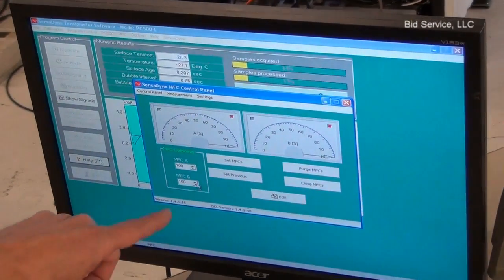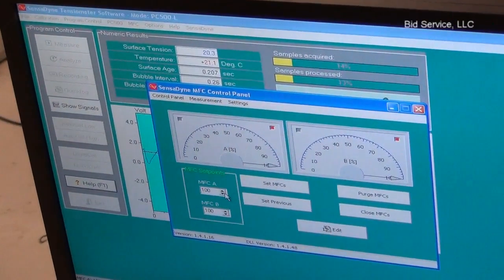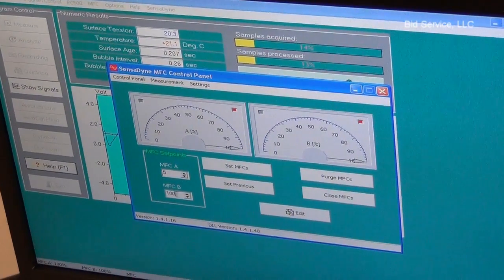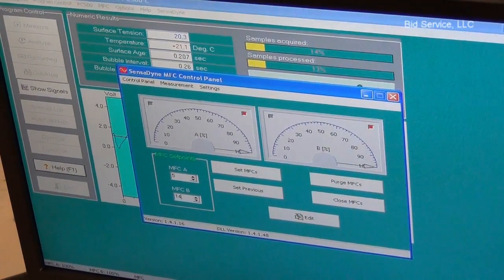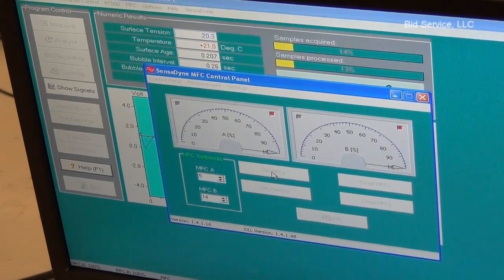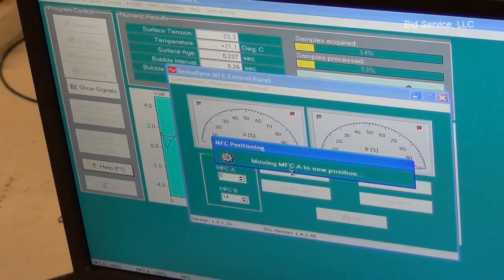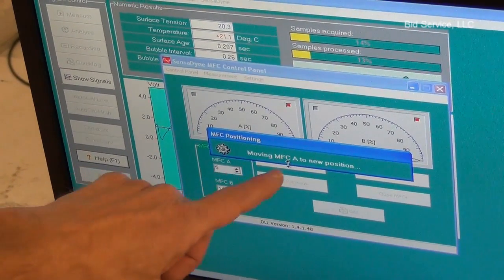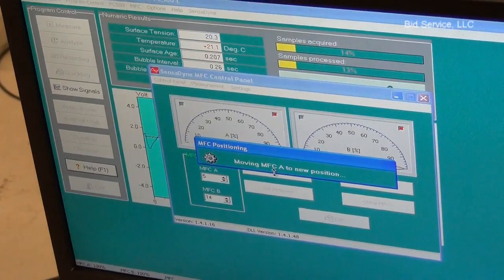From here I'm just going to set them back to where they were. MFCA was set at 5 — I can just type that in — and I think this was at 14, and I can set. It's adjusting MFCA; it's the smaller orifice.